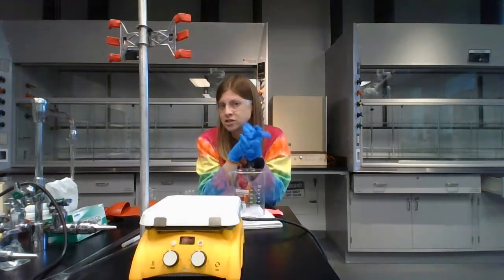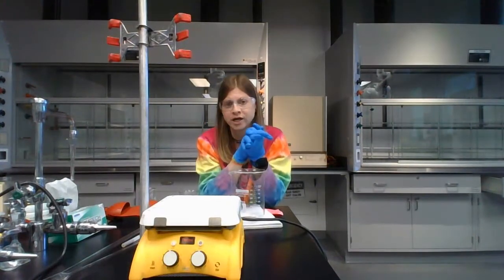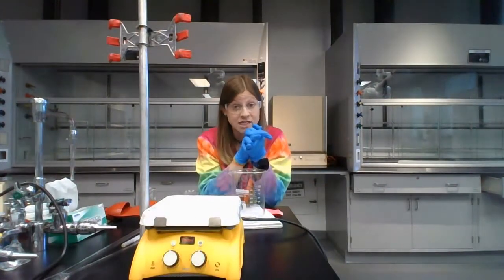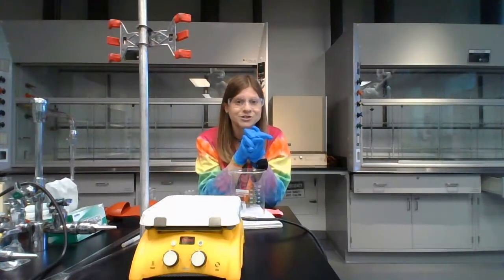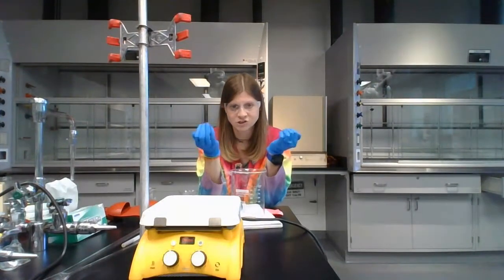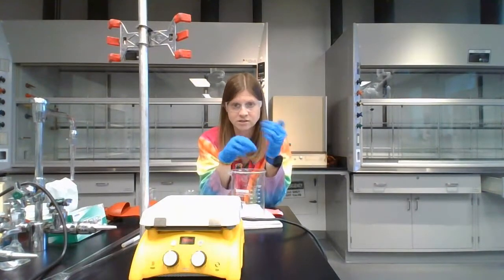So we're going to neutralize it just similarly to how we've neutralized other chemicals in this lab. It's just we will be having to add a base to this. The base we are going to add is actually real classy and fancy. It's pool neutralizer. So we're going to just be adding this solid base to this to make it react.